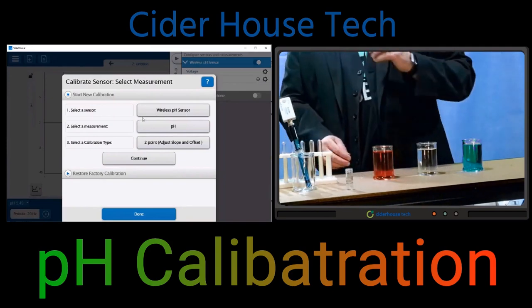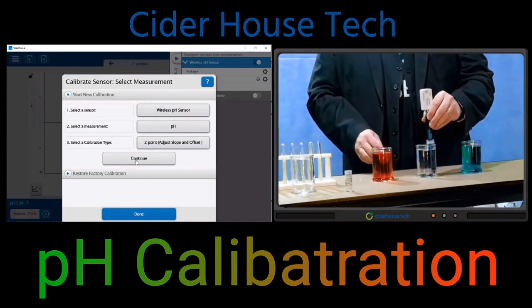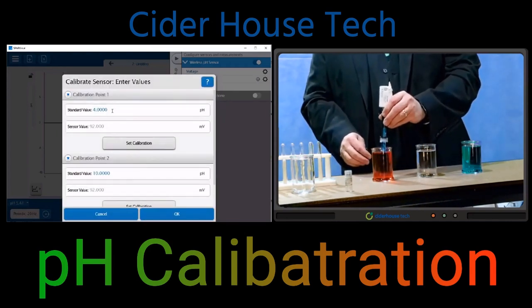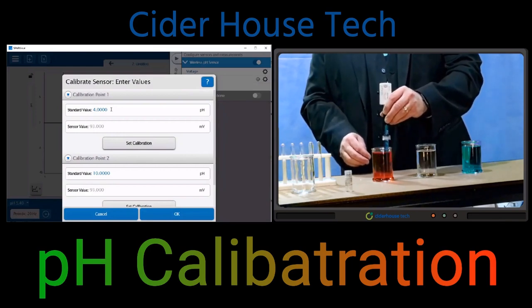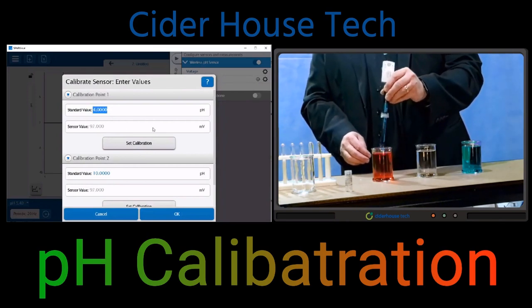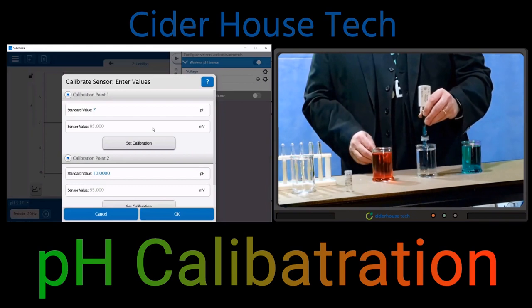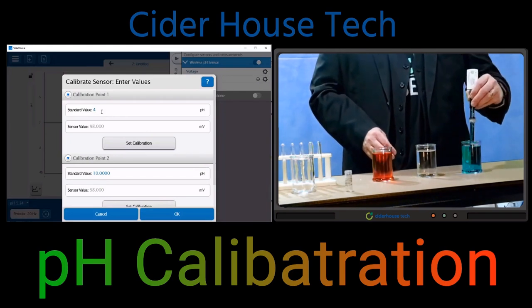I can see that I'm going to be calibrating my pH sensor, and I see that I've got the two-point method here, and I'll click on Continue. By default, the standard value that's listed first is a pH 4. That's actually the type of pH buffer solution that I have. But if you wish to change it, you can highlight this and then place in a different value depending on what the buffer solution is that you have. Again, the buffer solution that I have is a 4 buffer solution, so I'll enter that in there.